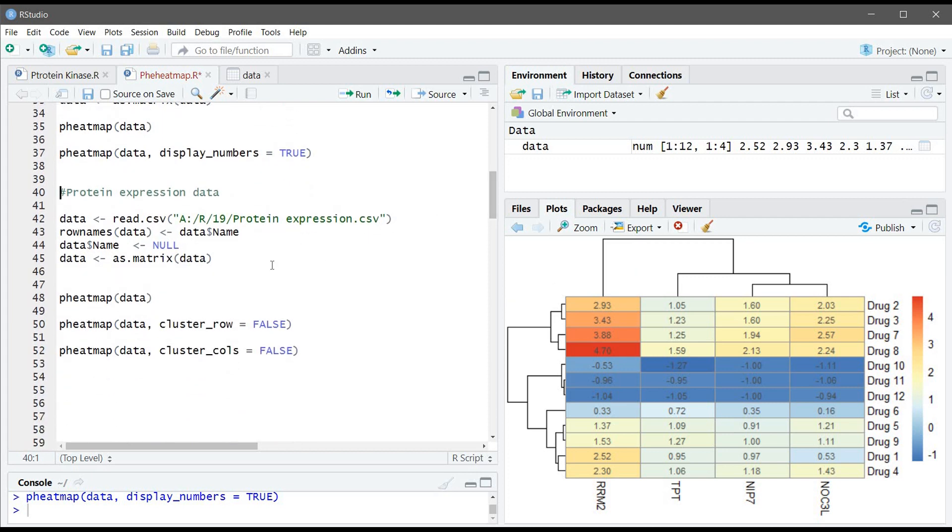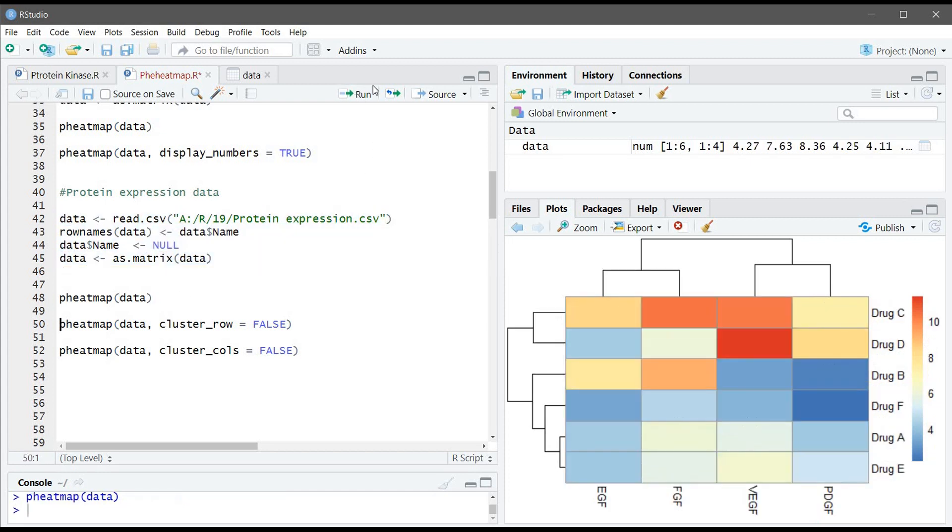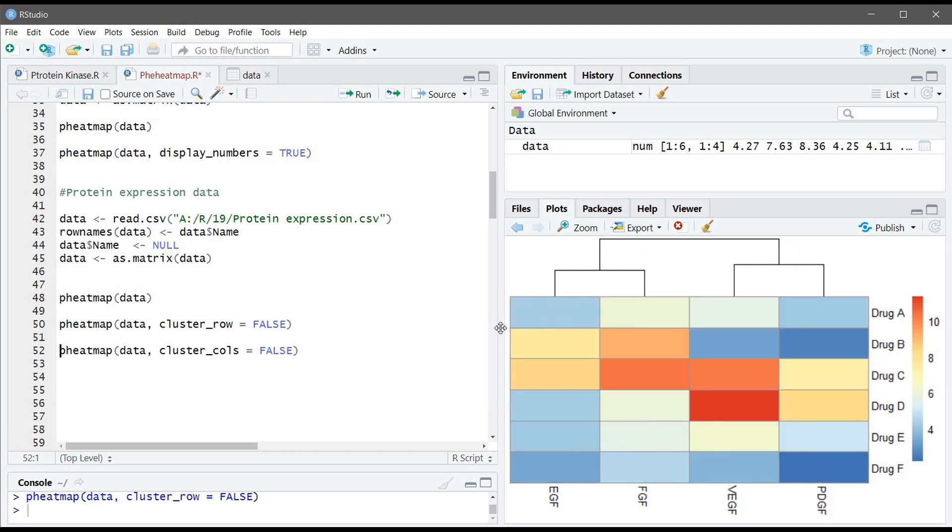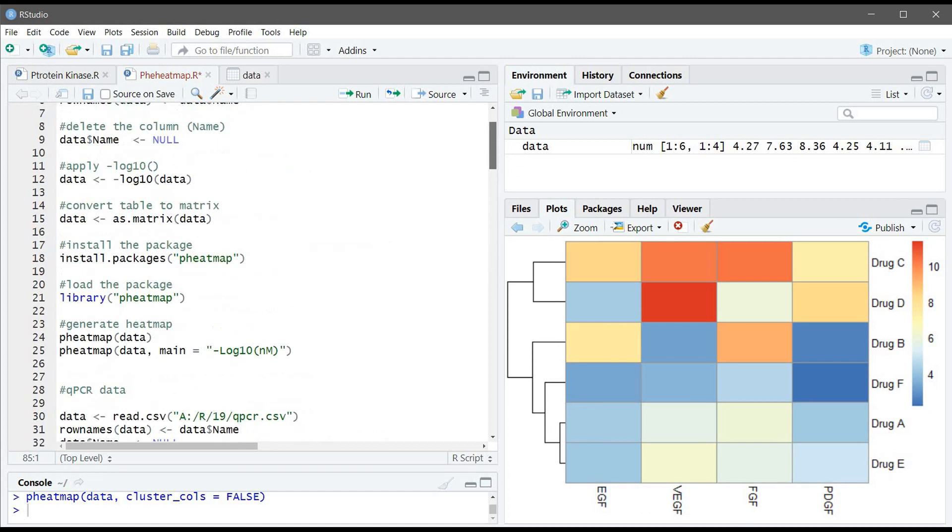So the last example is protein expression. Similar to the qPCR we don't need to use minus log10 so we will use the same commands. Let's generate the heatmap. So if you don't want to cluster the rows, if you just want to cluster the column you can use cluster_row equal FALSE. You can see there is no clustering here. If you don't want to cluster the columns you can use cluster_cols equal FALSE and it won't be clustered.